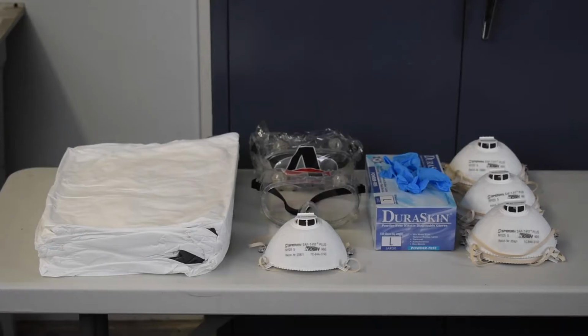There are 4 components of PPE described here. First is a gown or coverall with built-in booties and a hood. In this demonstration, we will be using a full-body coverall. Second are non-sterile disposable patient examination gloves, which are used for routine patient care in healthcare settings. These are appropriate for the care of patients with suspected or confirmed COVID-19.